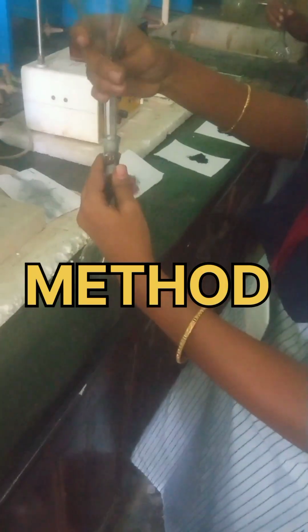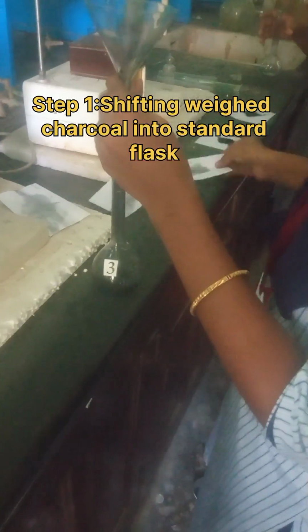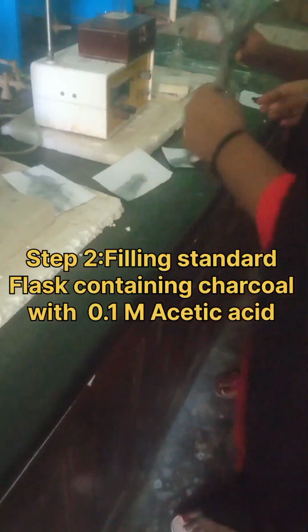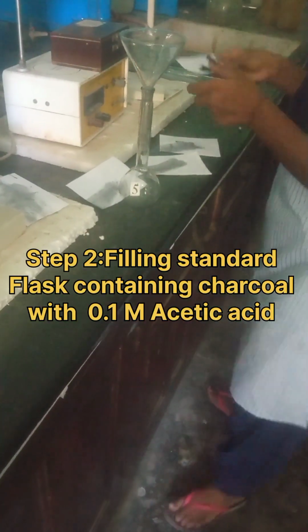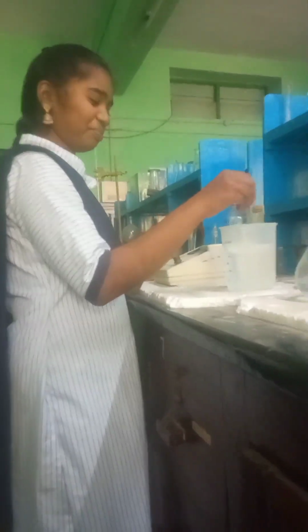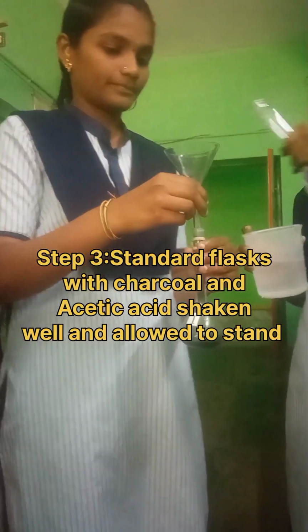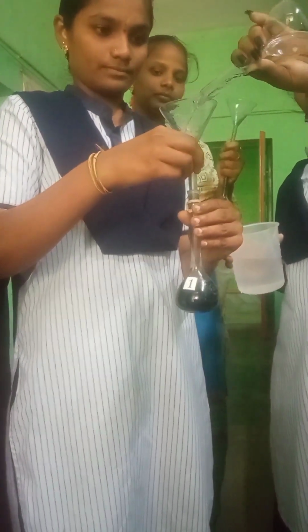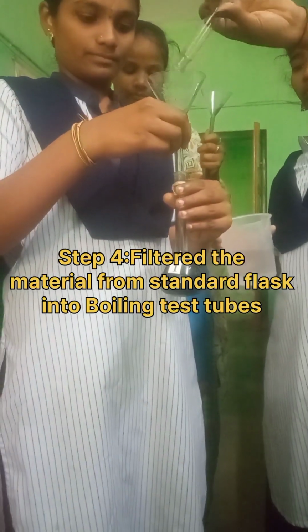So, the materials and apparatus are given in this video, and the procedure is: the weighed charcoal is shifted into numbered standard flasks, and the standard flasks containing charcoal are filled with 0.1 M acetic acid. After filling with acetic acid, the standard flasks are shaken well and allowed to stand.